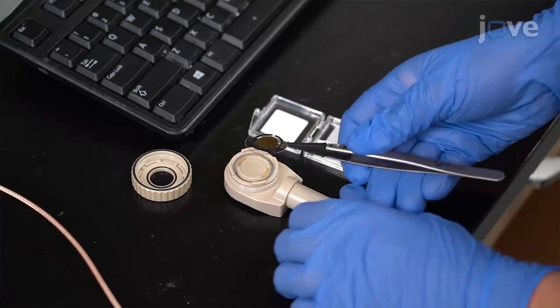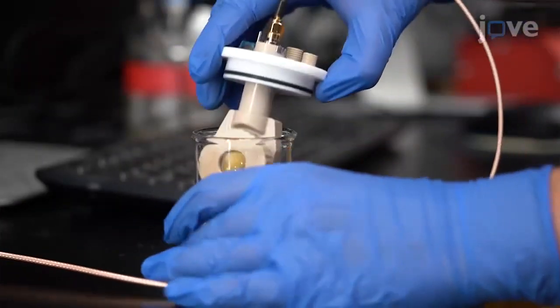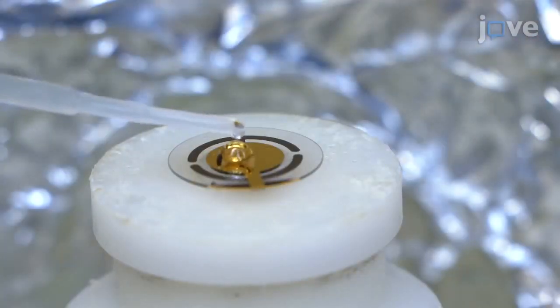When extracting mechanical property information, it is necessary to work with films of an appropriate thickness. Researchers must be careful to apply the correct modeling for a film during analysis. The technique is well suited for studying a wide range of material systems and for understanding how mechanical properties of polymeric materials respond to the environment.